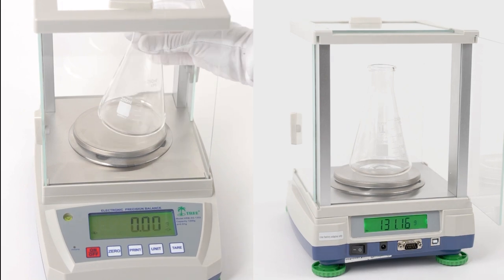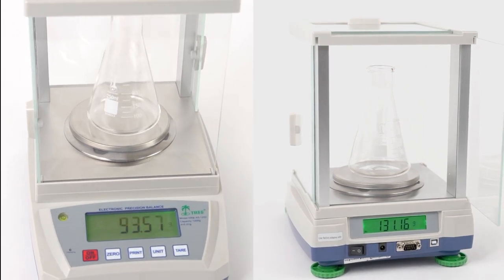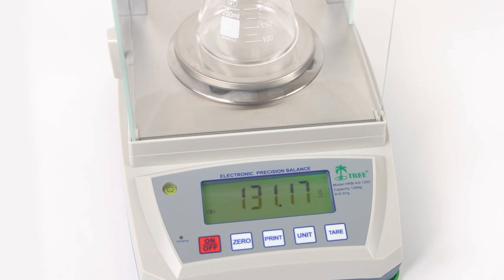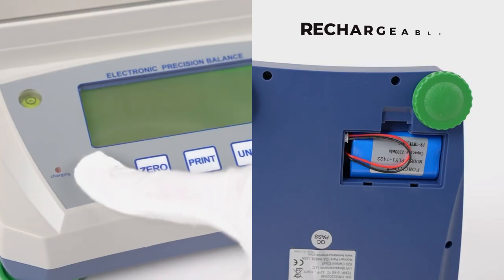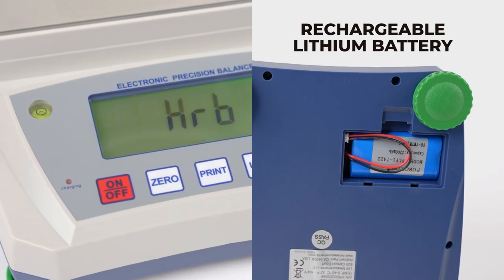Its forward and rear-facing LCDs are responsive and easy to read. This balance also has tear, zero, and print buttons for easy weighing. Plus, you can power it with a rechargeable lithium battery.